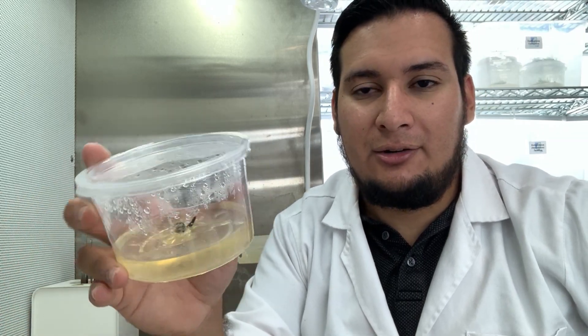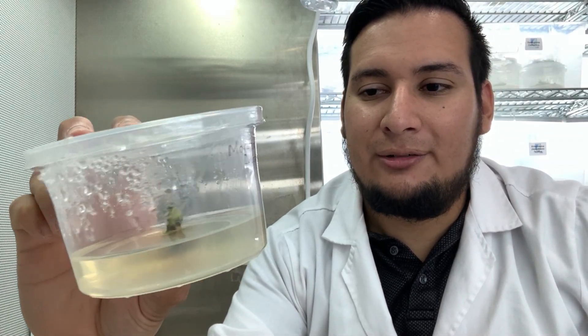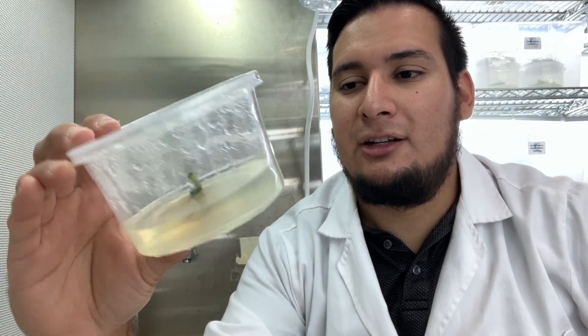I had the roots, the main plant, and the shoots it was growing. The roots fully died and got contaminated — you can see the media is even yellow, so it's not good at all. That one is going to the trash. The main plant doesn't look good either; some parts are still green but it has quite a lot of bacteria growing, so I'm probably throwing that away as well.